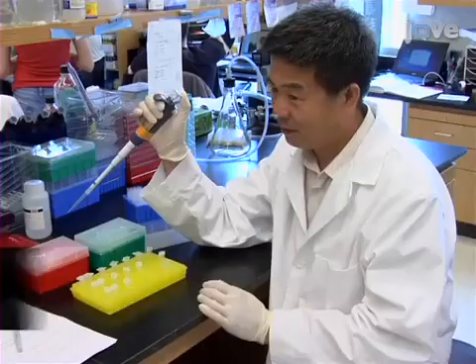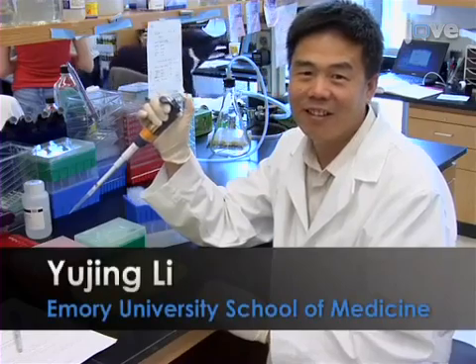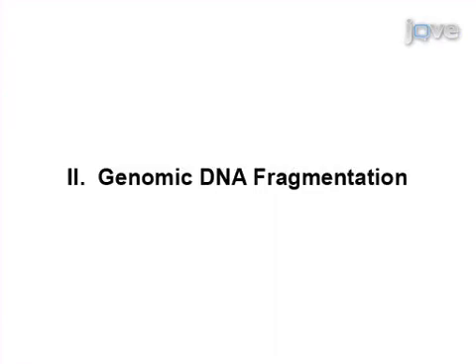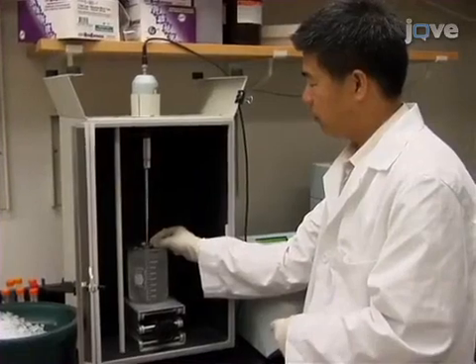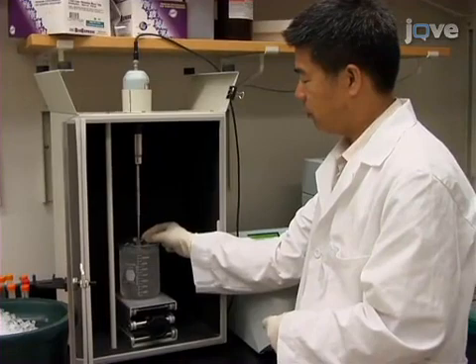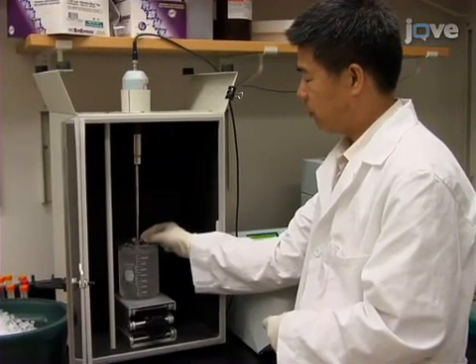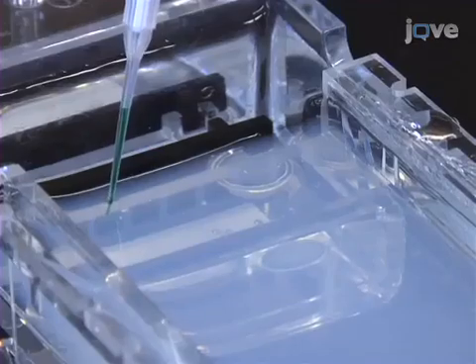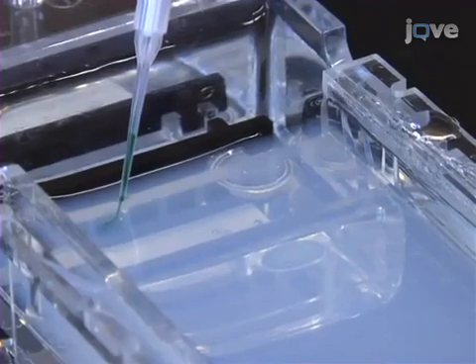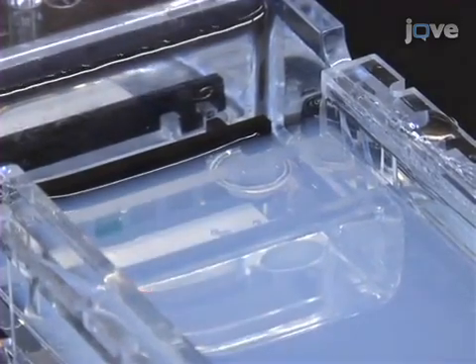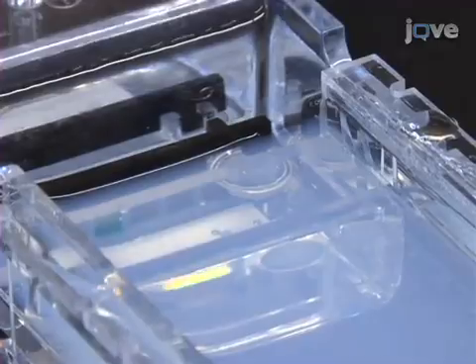Yu Jing Li, a senior research associate in the lab, will demonstrate this protocol. First, sonicate the genomic DNA to a size range suitable for the genome-wide sequencing platform. Verify the size distribution of the fragmented genomic DNA on a 1% agarose gel.